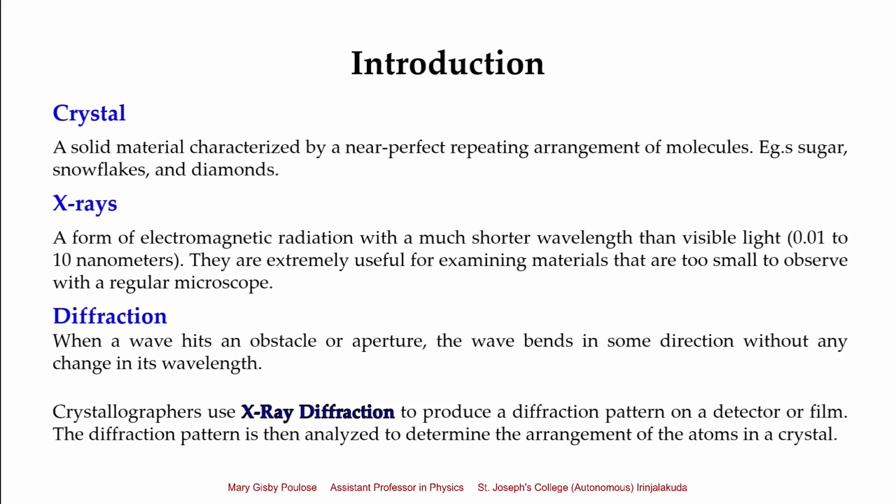In X-ray diffraction, the people who study materials using this technique are usually called crystallographers. They study crystals. They use X-ray diffraction to produce different diffraction patterns on a screen, on a detector or film. And then these patterns are later studied and analyzed to understand the arrangement of the atoms or molecules within that particular crystal.